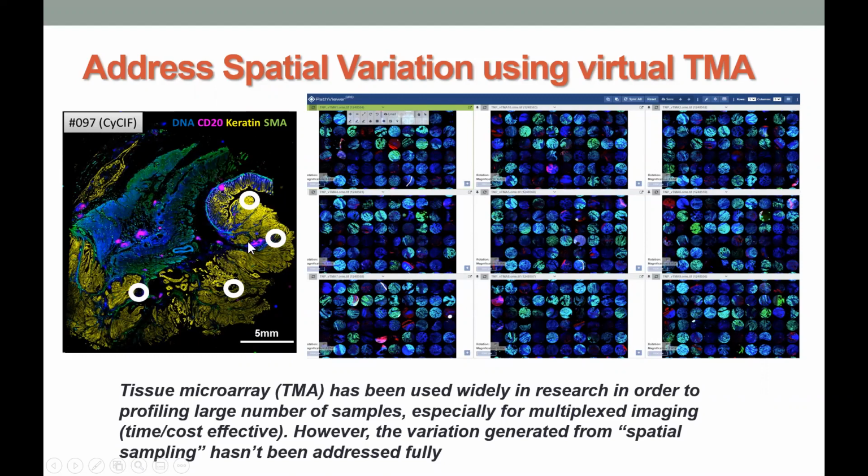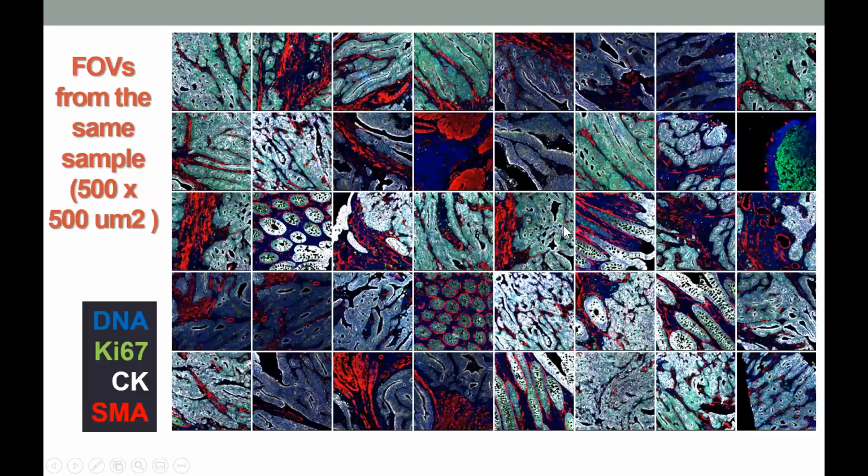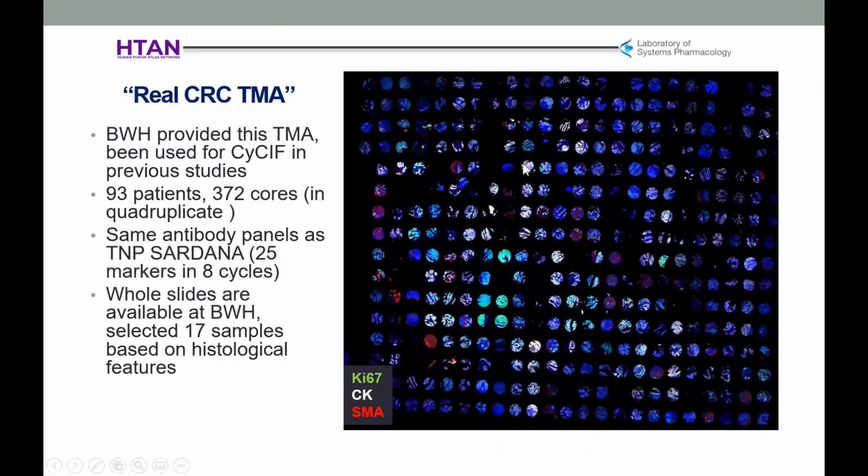So that raises our concern. And here is another example to show, even more simple than that, just looking at the different field of view, you start to see a very different picture from one given sample. So although we get a very striking result, we start to ask ourselves if this is really true or it is just due to our virtual version of this process.